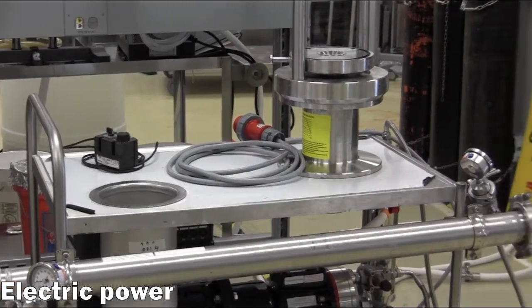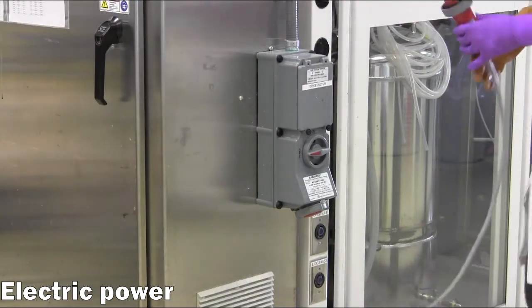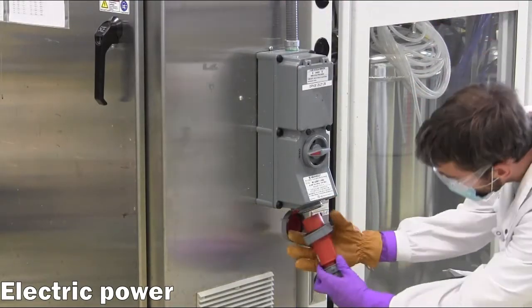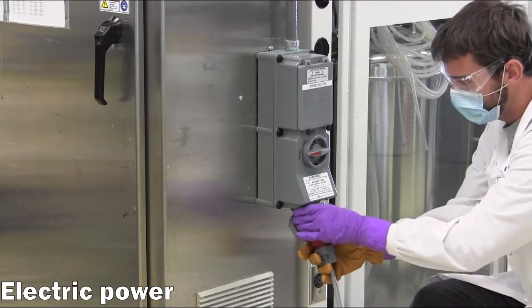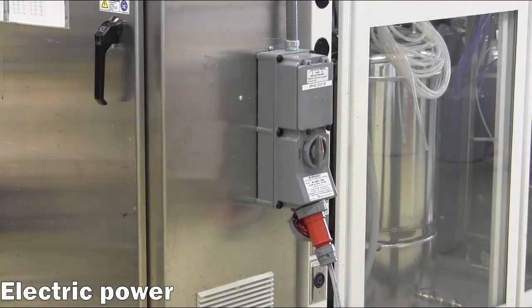After donning leather gloves, the electrical cord may be connected to a 480-volt power source. The technician then steps to the side of the breaker box, looks away, and switches the breaker to the on position.